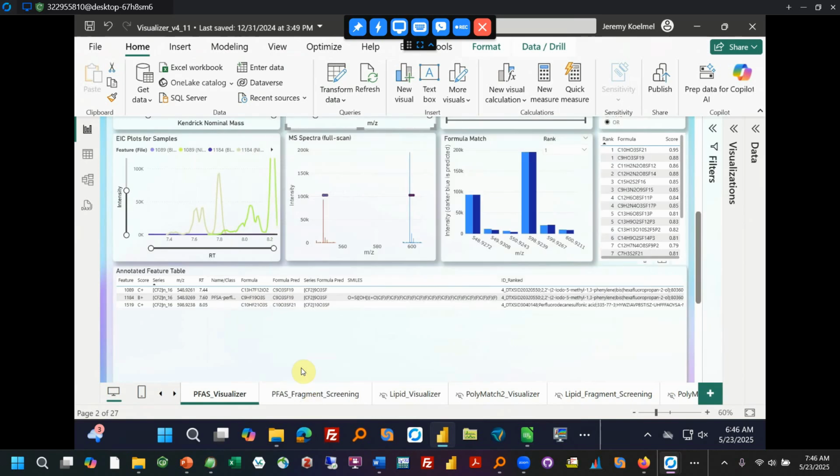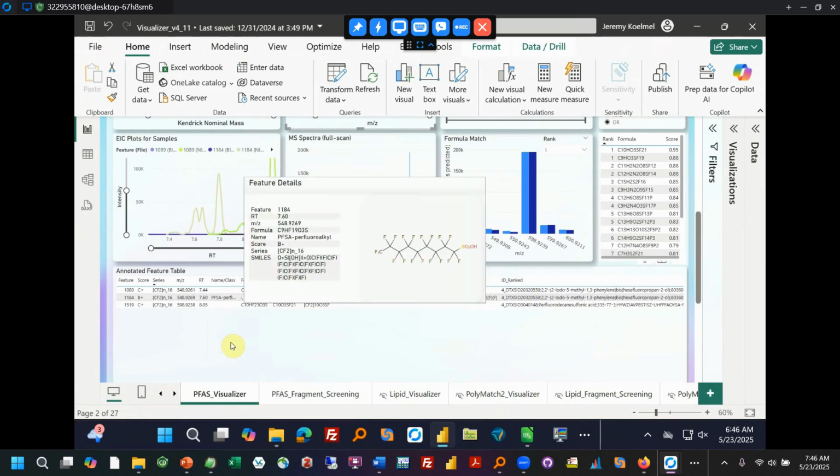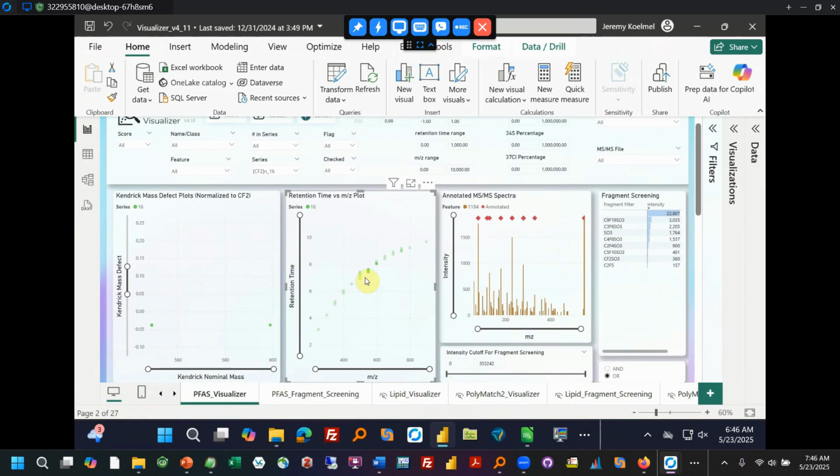So sometimes you can have missing species as well. And so if you want to make sure that you have everything, you can note that as well. But I'm not going to note that. I'm just going to assume, okay, both of these are correct.